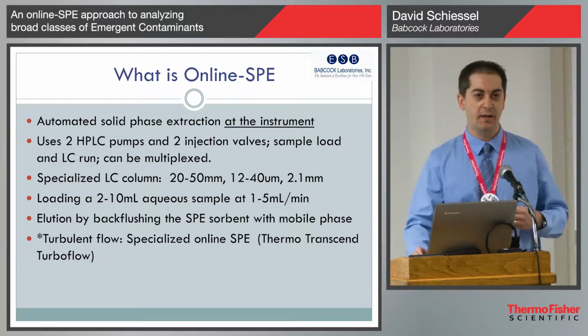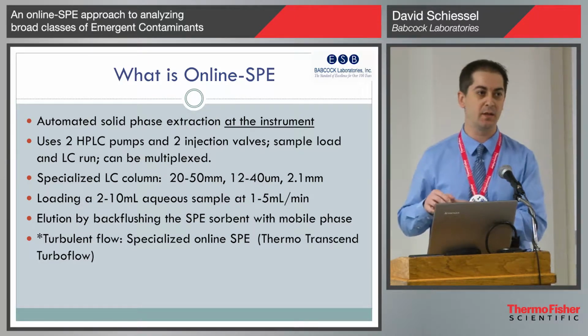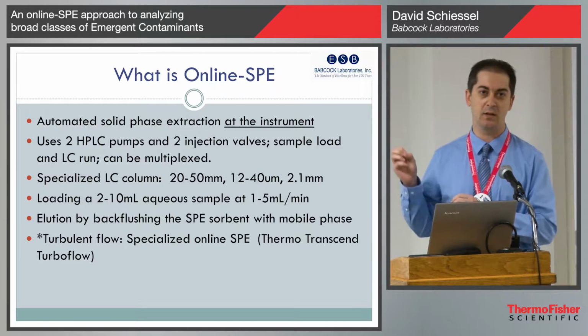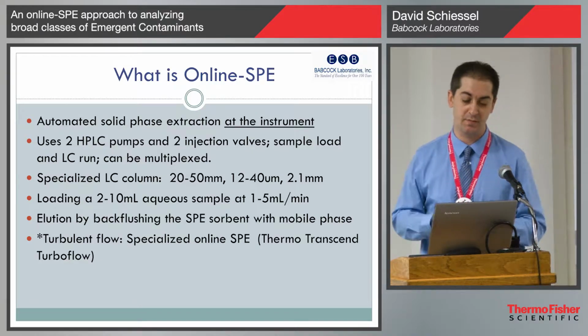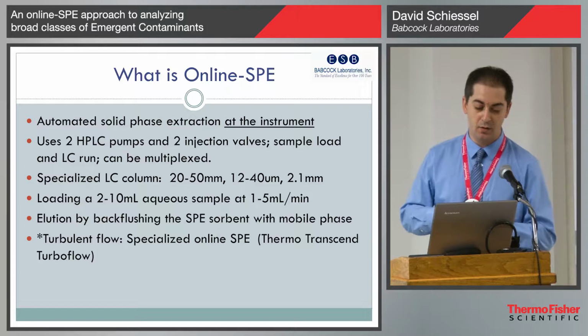So when I talk about online-SPE, I'm basically talking about the solid phase extraction all being done at the instrument. That means we can take a sample and load it either unfiltered or filtered, as long as we produce some study that shows that our analytes are not being absorbed or lost.